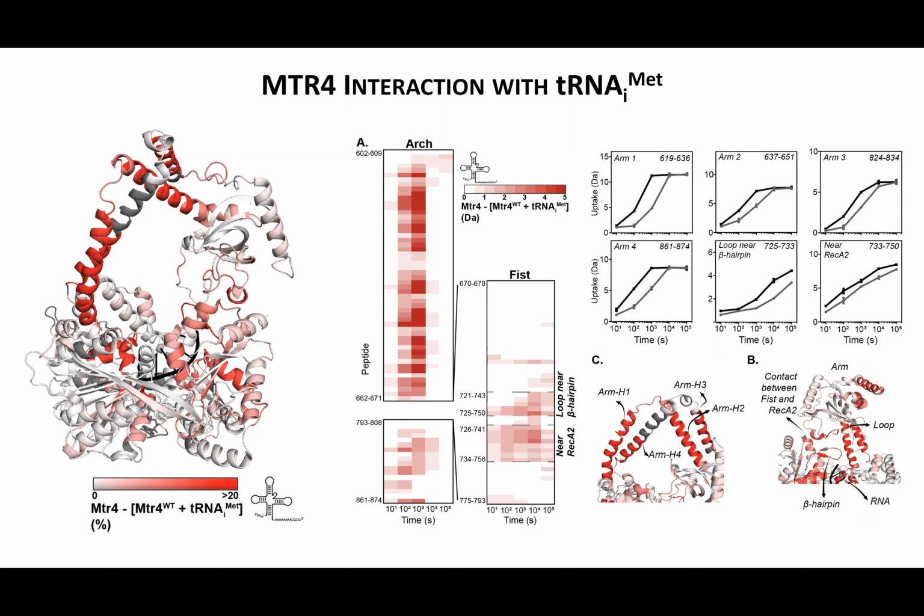I think we have a question in the question box, Sheena, from Anonymous. Chemical chaperones are known to protect unstructured and hydrophobic regions. How do you find these conditions challenging in HDX? So I'm not sure what you mean by chemical chaperones. Maybe we're talking about molecules that protect regions of protein structure during transient conformational changes.